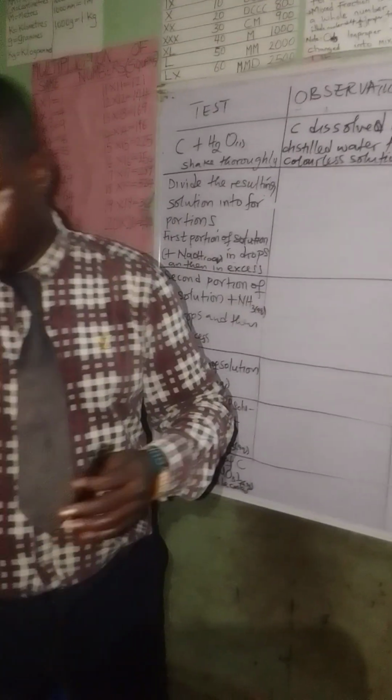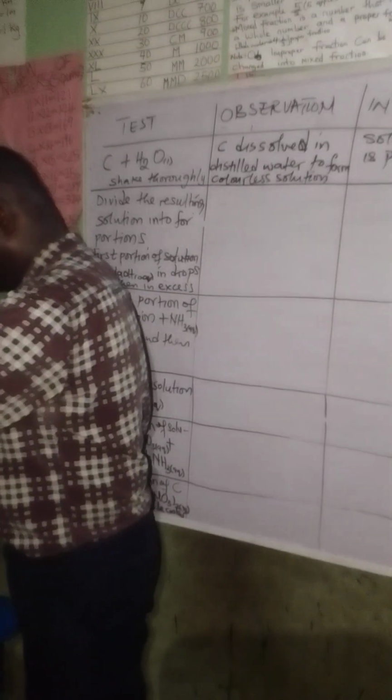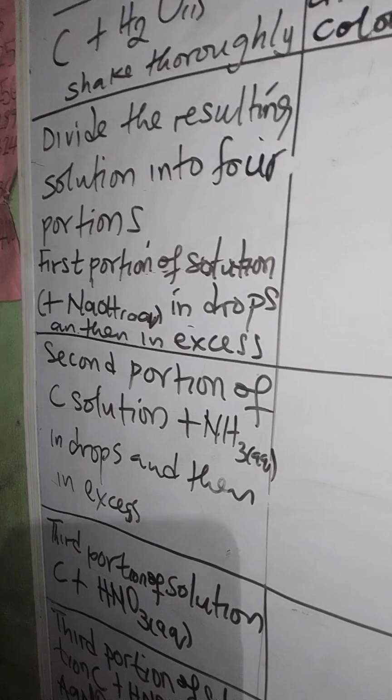So now we are asked to divide the resulting solution into 4 portions. Let's see what happens to the first portion.